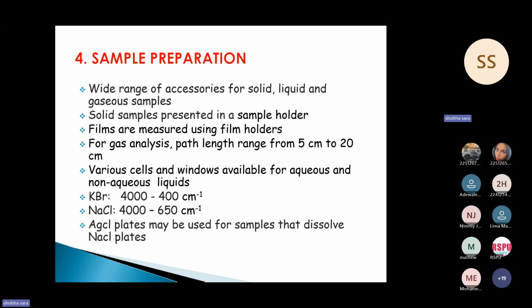For solid samples, we have a sample holder. Even films we can measure. We can use the film holder to hold the film. We can even analyze gaseous samples. I will come to that in the next slide. And for FTIR, various cells and windows.